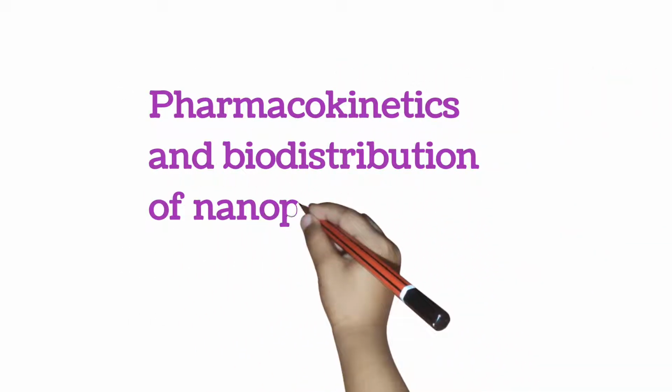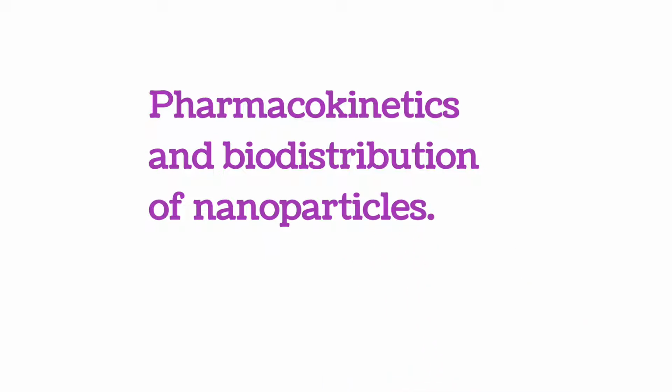So in vivo imaging is important for determining the pharmacokinetics and biodistribution of nanoparticles, and not only nanoparticles, whatever you want to see, but the condition is you need to tag it with the dyes, or it should be comparable.